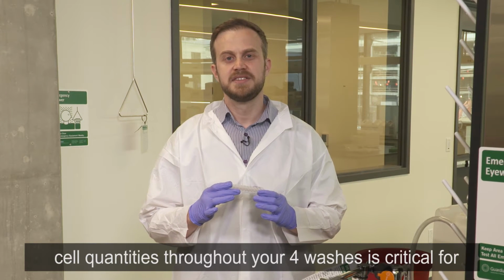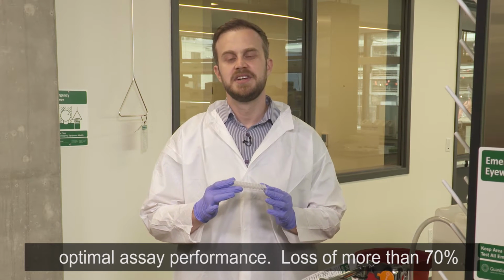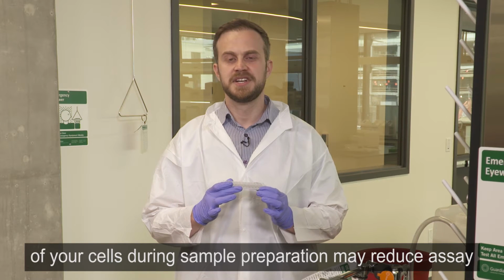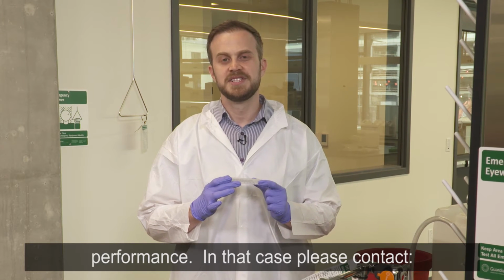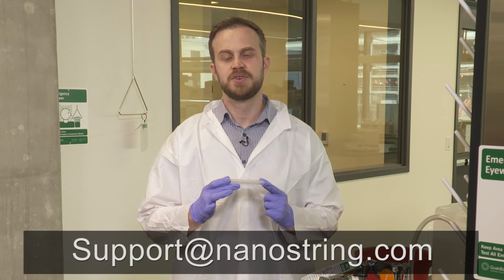Maintaining sufficient cell quantities throughout your 4 washes is critical for optimal assay performance. Loss of more than 70% of your cells during sample preparation may reduce assay performance. In that case, please contact support@nanostring.com before proceeding.